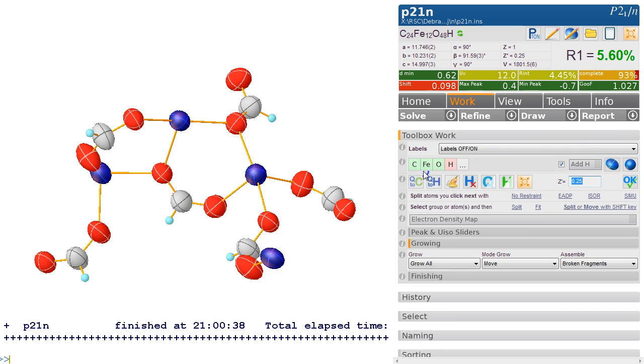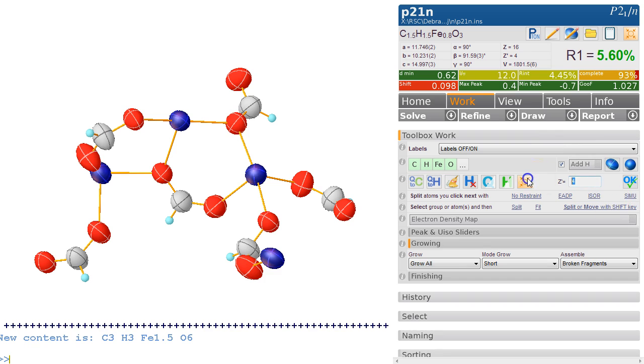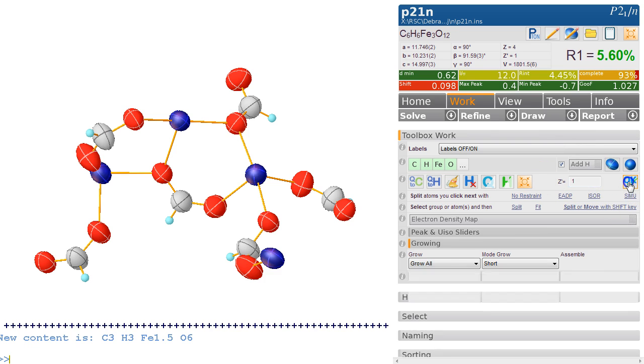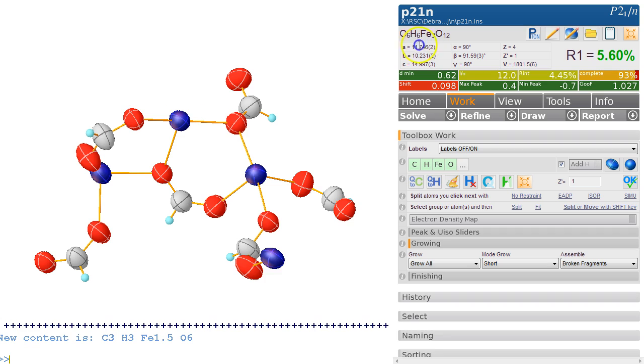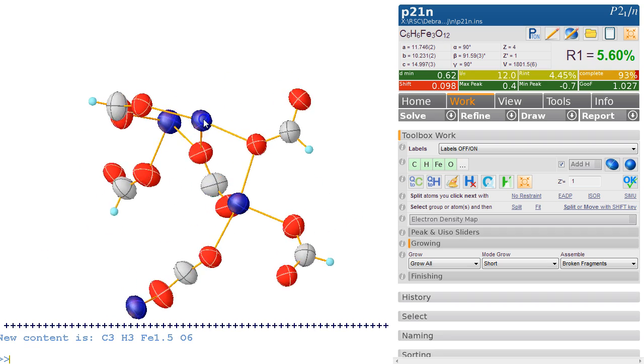Let's just say we set it to 2 and see what we get. So this is now C3H3Fe1.5—that's not very useful. So we could set it to 4. Does that make any sense? Now that doesn't make any sense. What about just 1? And we have a unit of C6H6Fe3O12.